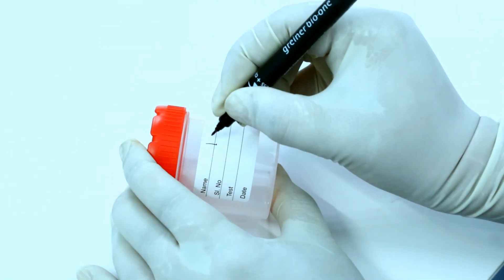Bring all the reagents to room temperature. Label the container with ID.